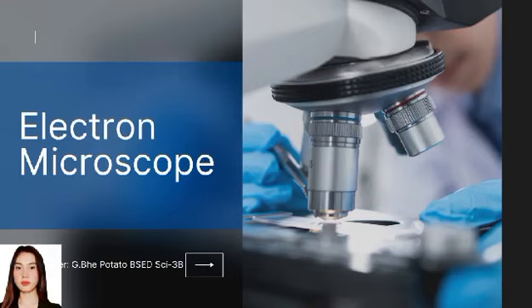So it has two types, the TEM and SEM. The transmission electron microscope provides high-resolution images of the internal structure and composition of specimens, while the SEM, or scanning electron microscope, provides a detailed view of the surface topography of the specimen.